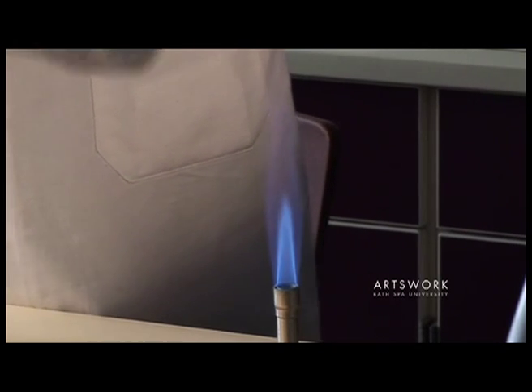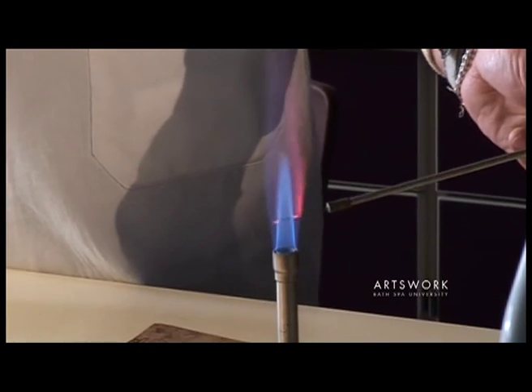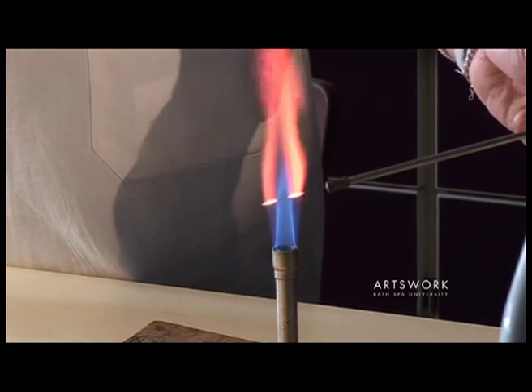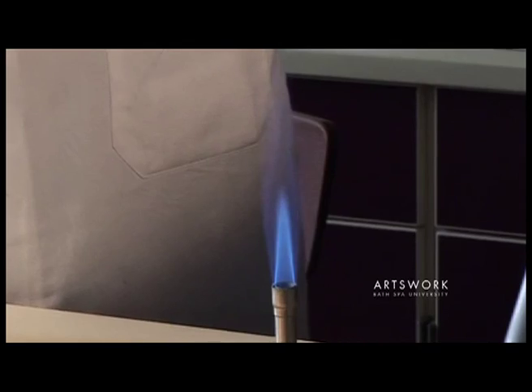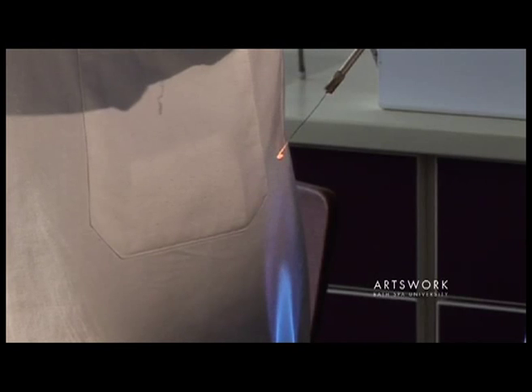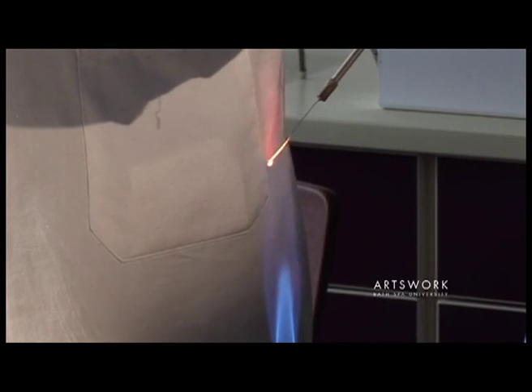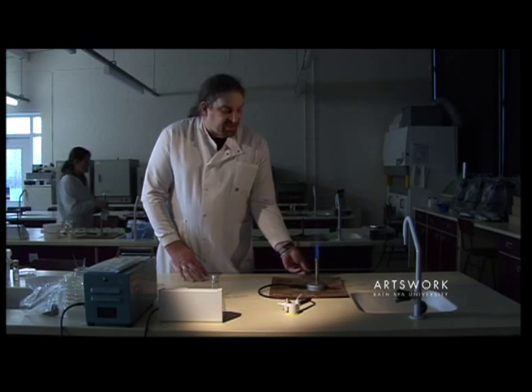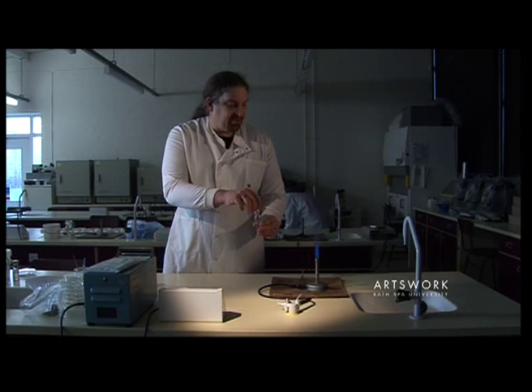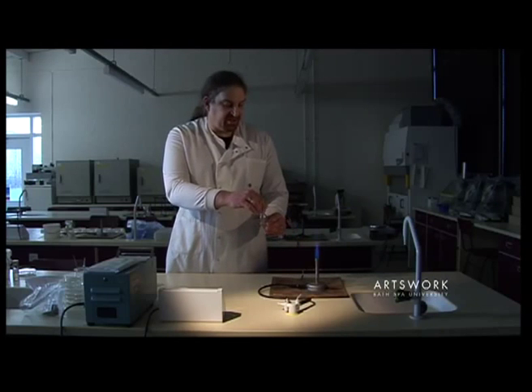If you put the loop too low in the flame, you're only sterilising parts of the loop at any one time. Alternatively, if you have it too high, the flame is cooler so it's not as effective at sterilising that loop. The same applies if you're using the flame to sterilise bottles — once you open the bottle, pass them through the hottest part of the flame to sterilise them.